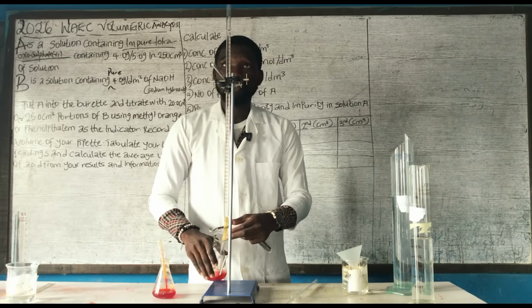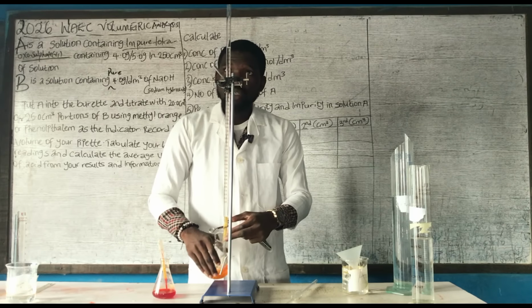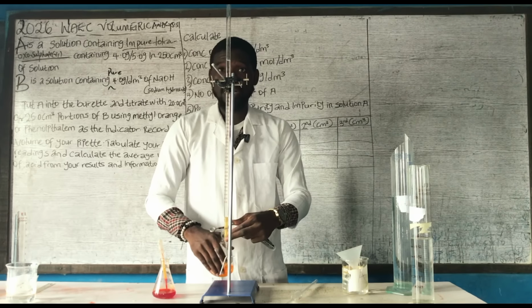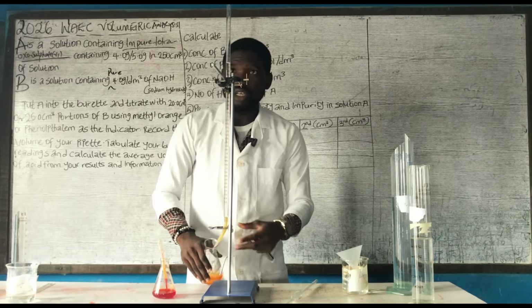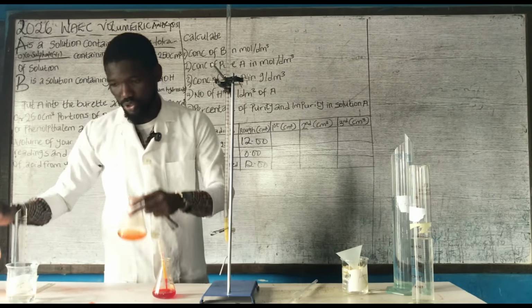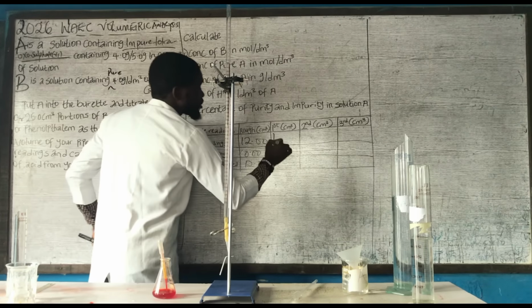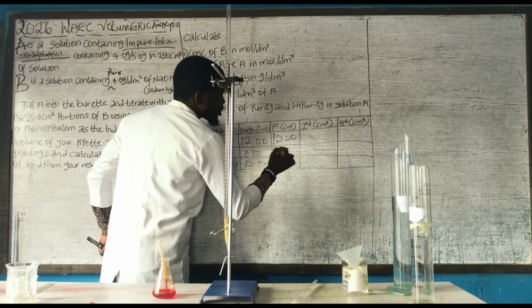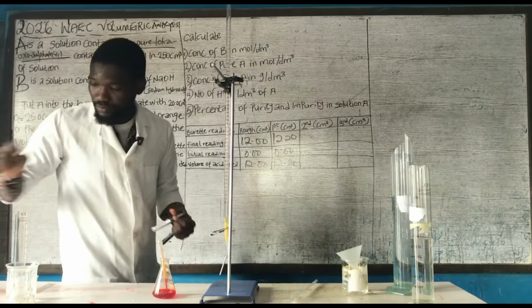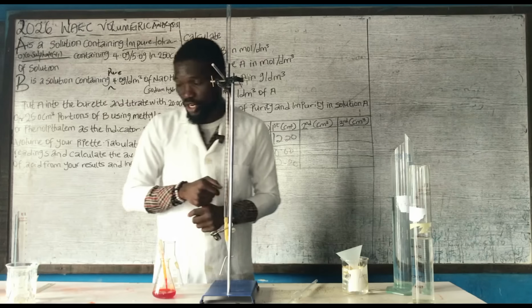So let's be careful. Let's have something similar to what we had earlier. Okay, I have 12.2. So this is the first and the second. I have 12.20. So the next one, I have to continue from this place, 12.20.